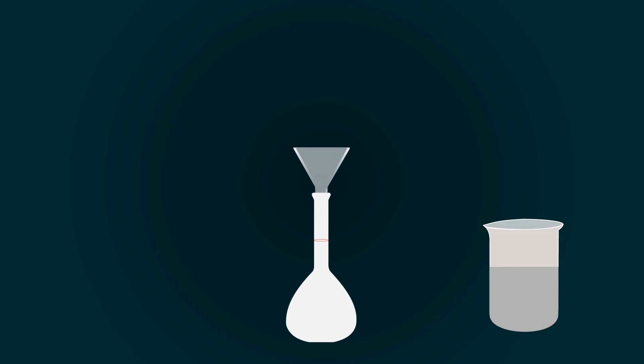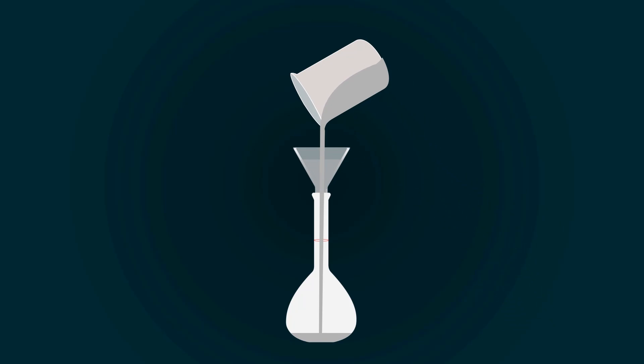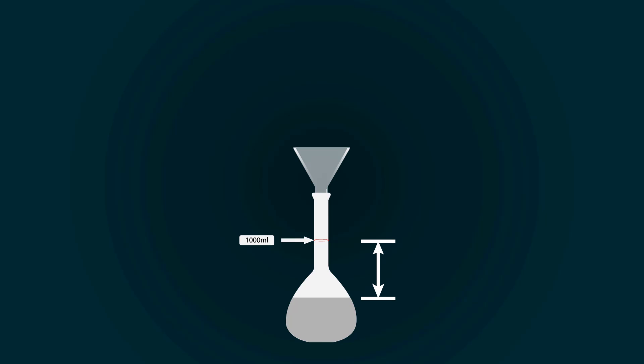Now, pour all the solution into the volumetric flask with the help of the funnel. You have to fill the volumetric flask up to the 1000 milliliter point, for that you have to add more distilled water.